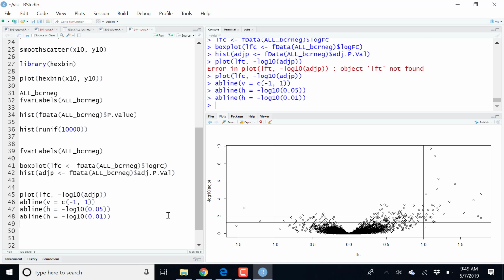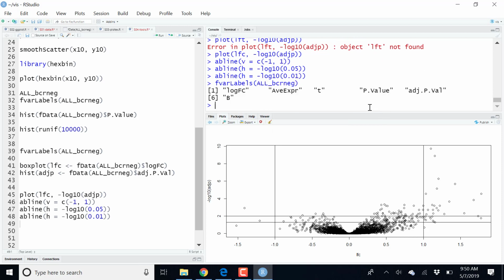Okay? Yes? So I'm wondering, can you define in the code what method you use to adjust p-values? Yes. So here, limma automatically uses, if I remember well, Benjamini-Hochberg to do the adjustment. It's done automatically, and that's very often a very sensible method to use.